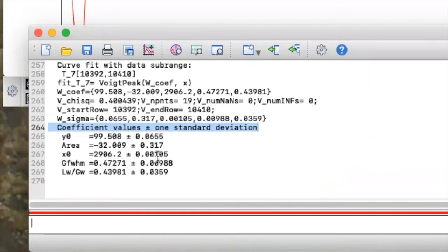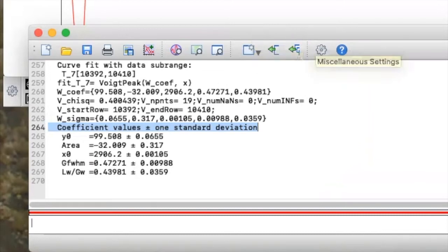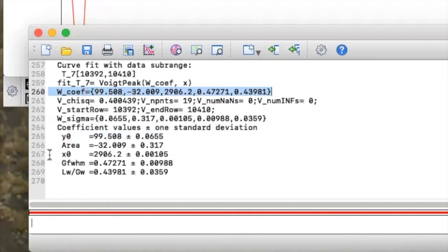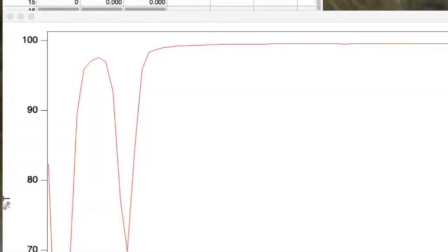Now I've got a number, but I still only have tenths-place resolution displayed. The accuracy of the fit actually goes out to the thousandths place — how can I get that? Well, the way I can do that is with a little bit of programming. We did a fit; the fit gave us a coefficient wave, w_cof. The central wave number is w_cof element 2 — that's the one we're after.